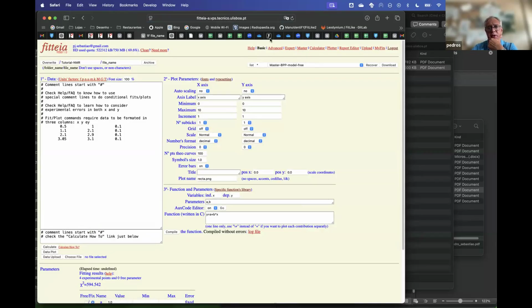If you notice here on the right side of the browser, you will notice several links. Besides the help, which is, I think, self-explanatory, you have basic, advanced, expert, and master, and these links only set up some defaults that help you deal with problems of different complexity levels.